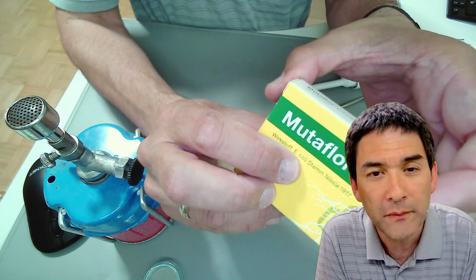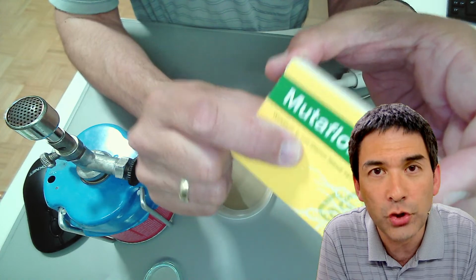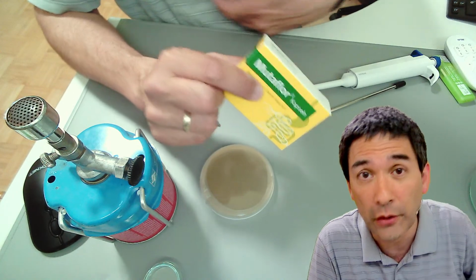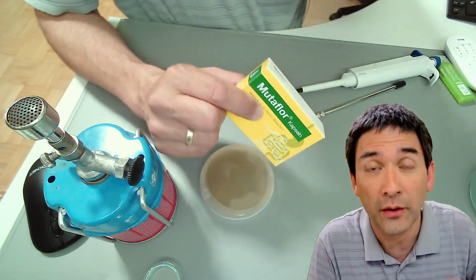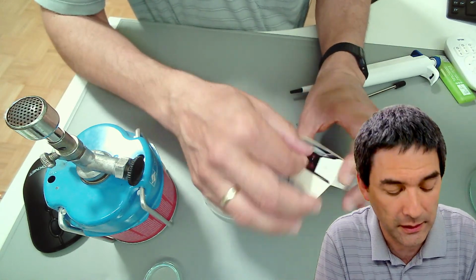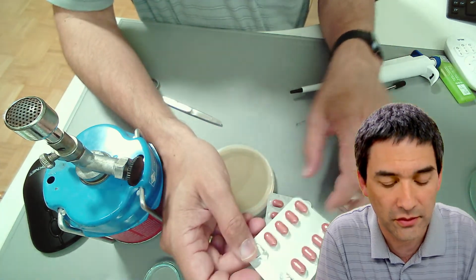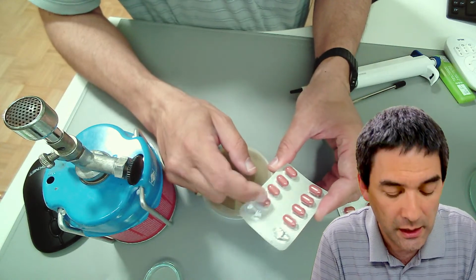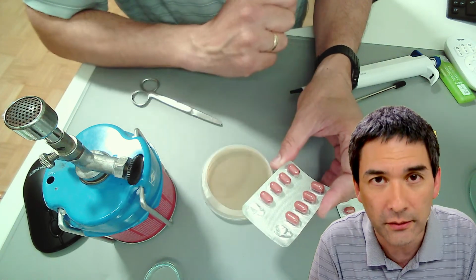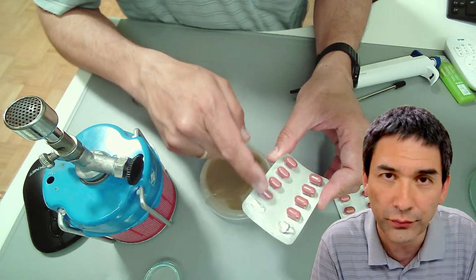Here, bacteria, freeze-dried. People who have a disturbed digestion, maybe because they have been on antibiotic treatment, which kills off bacteria, also those in the intestine, or people who have constipation and so on, can swallow E. coli bacteria, and they can be found in capsules like this. I've already used some of those, right? I'm going to cut them open. In here, there are freeze-dried E. coli bacteria.